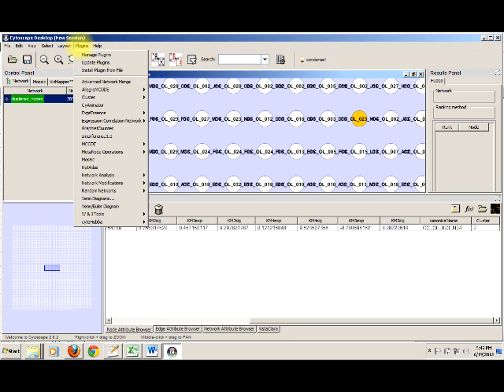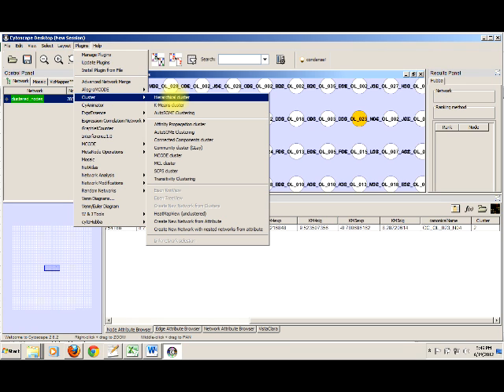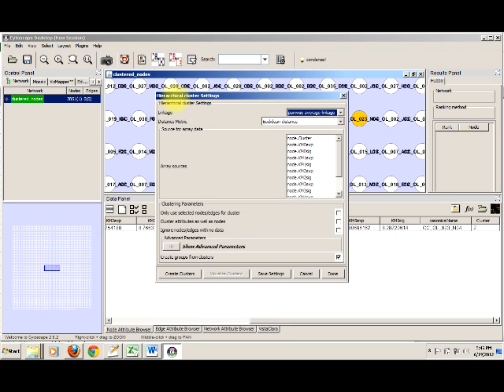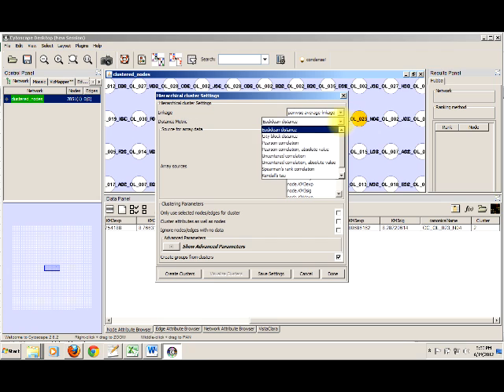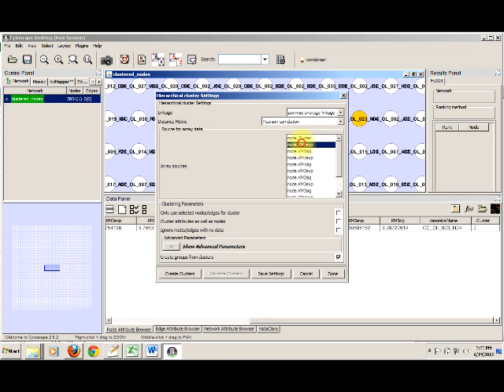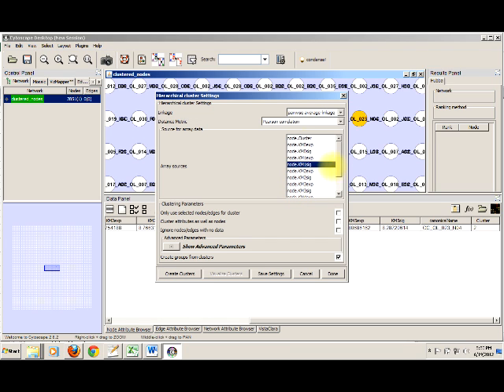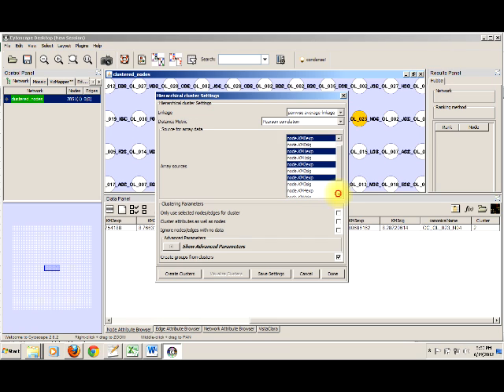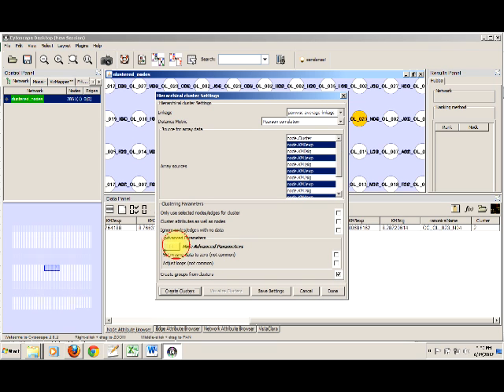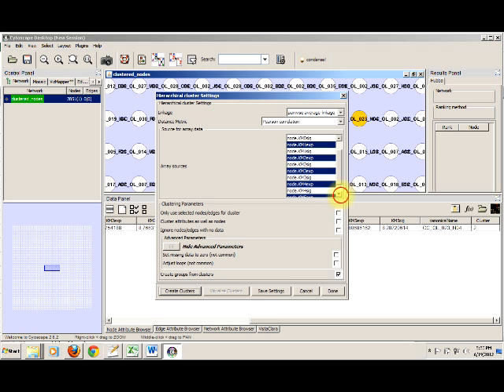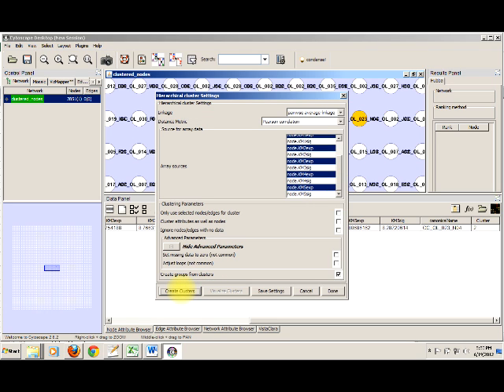Now let's start thinking through some analysis. The first thing we'll want to do is look at the hierarchical clustering question. We've seen this menu before — we'll select Pearson for consistency. The easiest way to get a good reading is to select the EXP values from the gene expression data. We don't want the significance values, just the expression values. Select each one of those, leave everything else as is, and go ahead and create our clusters.